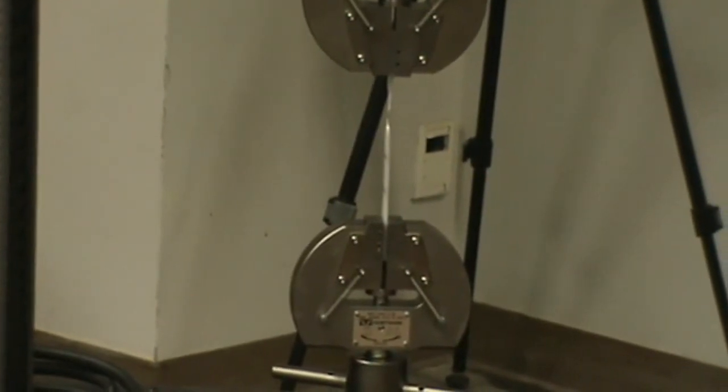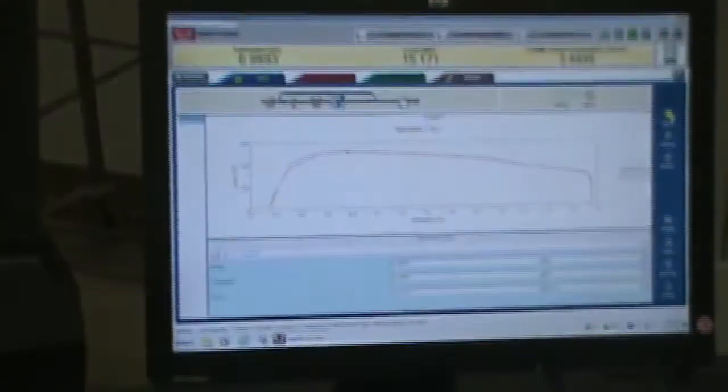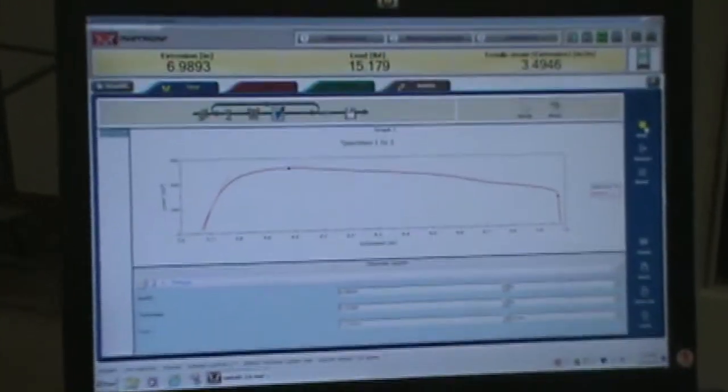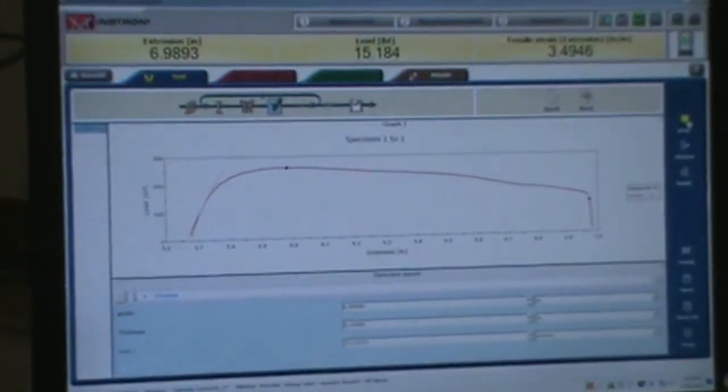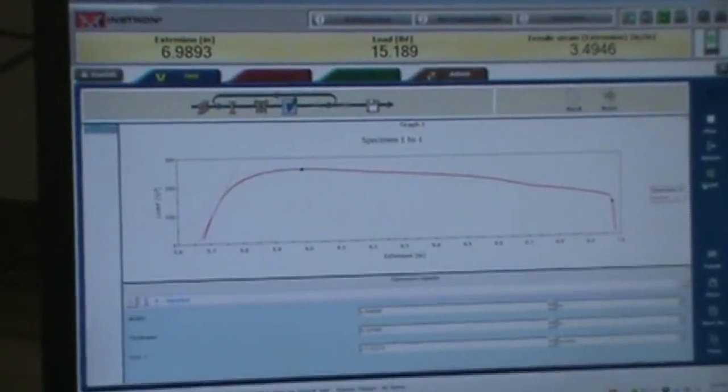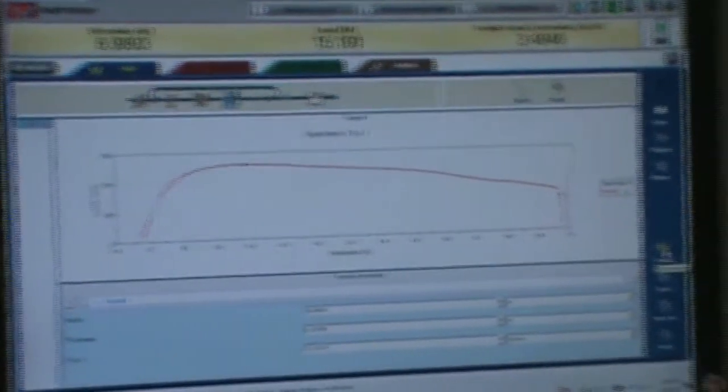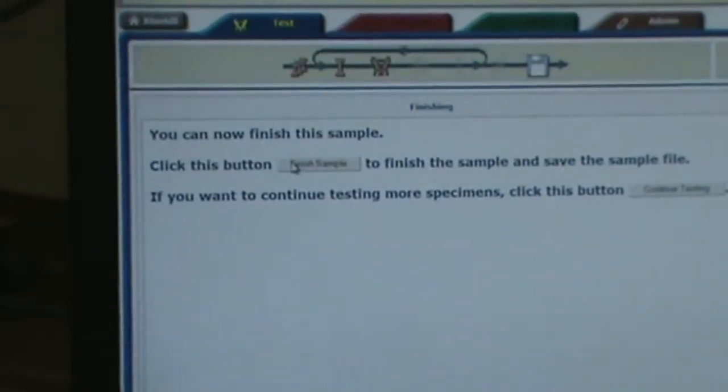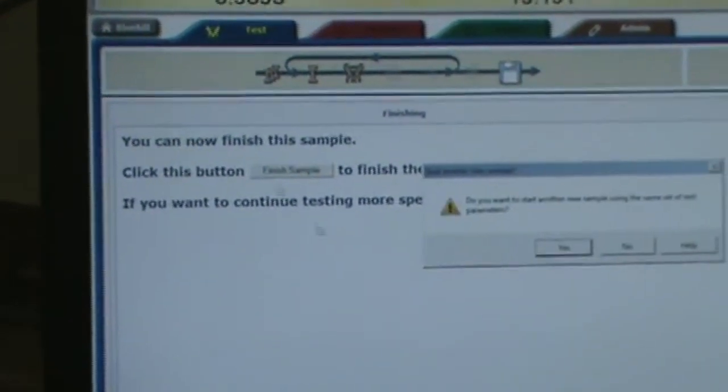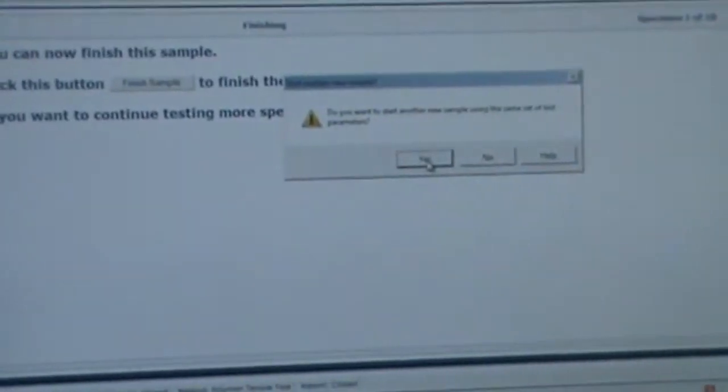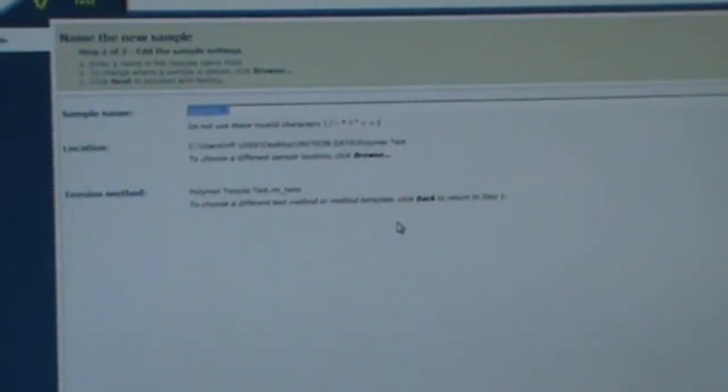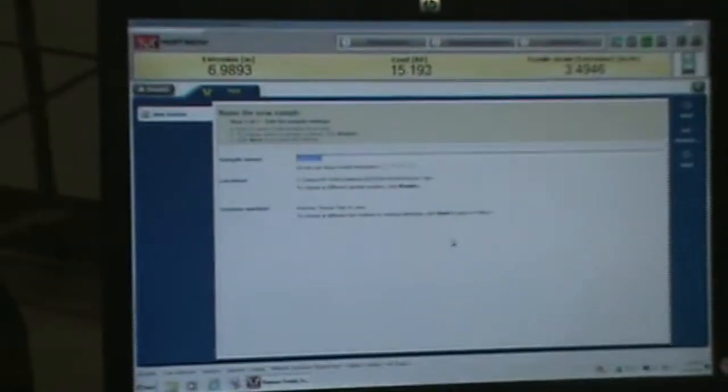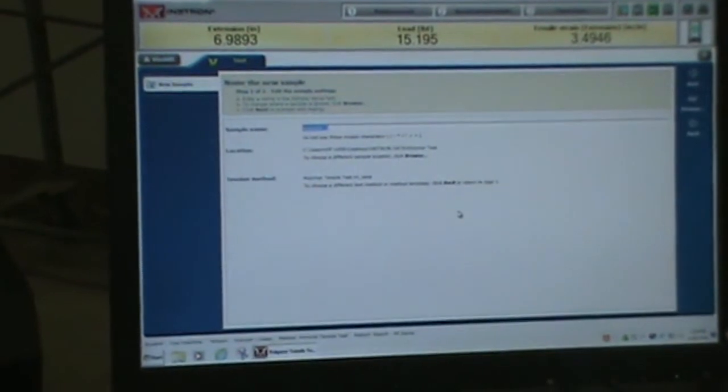Now this next step is very important. If you don't do this, item 13 on this worksheet, you're going to lose your data. So you come down here and go to finish. You come over here and go right to finish sample. And you're going to do a yes because we're going to do another test. That's all you have to do.